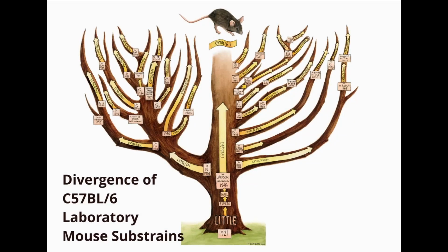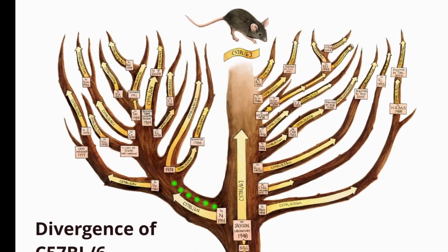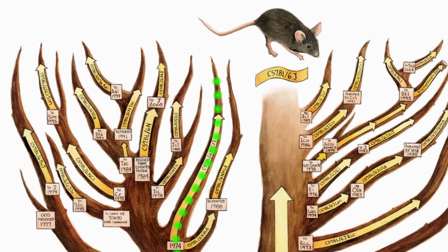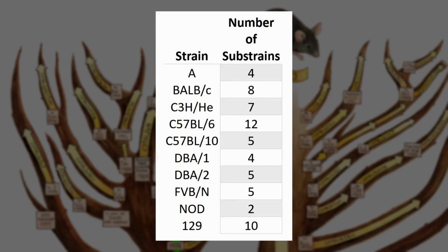In the final section, we discuss how diagnostic alleles can be used to detect the presence of commercially available substrains. Diagnostic alleles are mutations that arose over time through genetic drift in closed breeding colonies. The presence of these alleles in a sample is positive evidence for the corresponding substrain. We have identified all the biallelic SNPs with diagnostic alleles in MiniMUGA that are present in this set of strains. The number of substrains included in the analysis varies between 2 for NOD to 12 for C57BL6.